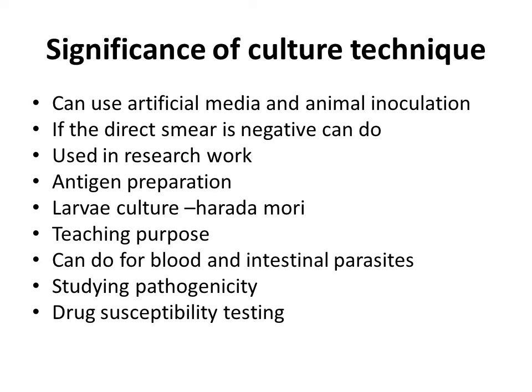If we want to study, we need to culture it and go further. And another thing, drug susceptibility test. This is also very important, like in microbiology. We are culturing, then applying the antibiotic loaded disc and we can confirm whether the parasite is sensitive or resistant. Nowadays plant materials are very familiar for identifying drug susceptibility.